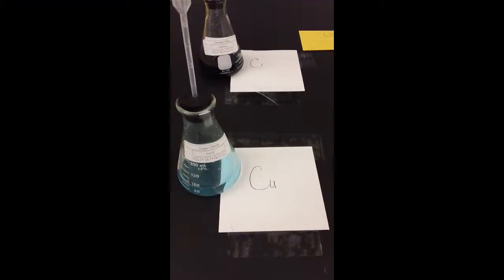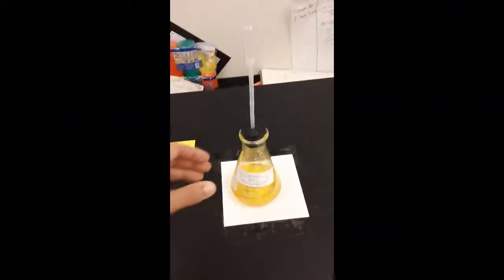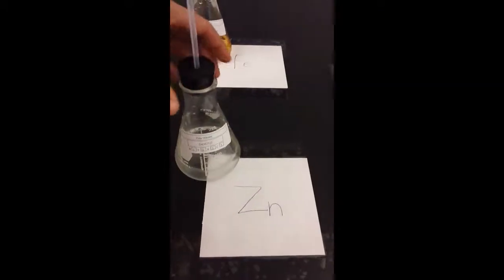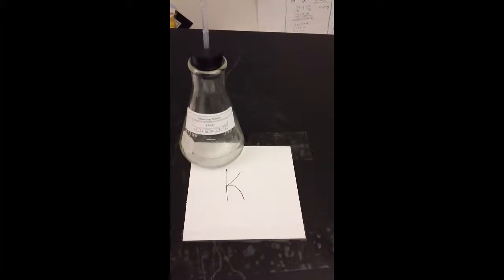Then we have Cu, and this is our copper chloride. We have over here iron nitrate, Fe for iron. We know this one is zinc nitrate, Zn. And then over here we have potassium nitrate, which is K.